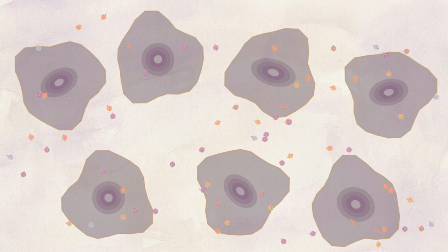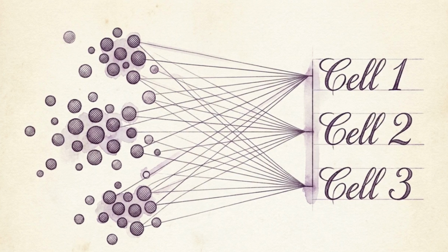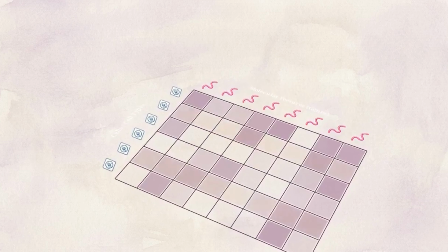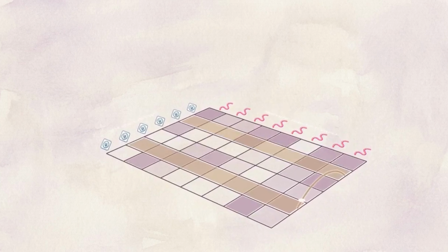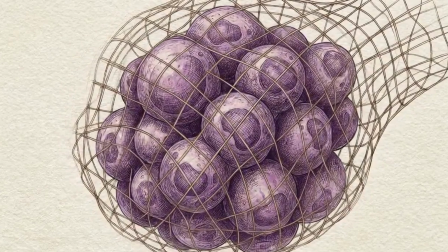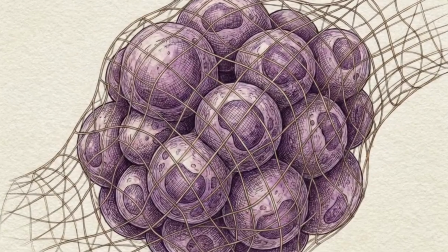These algorithms analyze DAPI-stained nuclei in the tissue image to draw boundaries around individual cell bodies, capturing specific transcript dots within them. Bioinformatics frameworks, such as Seurat version 5, use these computed borders to assign hundreds of thousands of isolated transcripts to specific individual cells. The output is a structured cell-by-feature matrix. Researchers can query this matrix to map cellular neighborhoods and compute ligand-receptor interactions across the tissue. While the chemical assays capture the raw molecular signals, it is computational geometry that actually defines the cells.